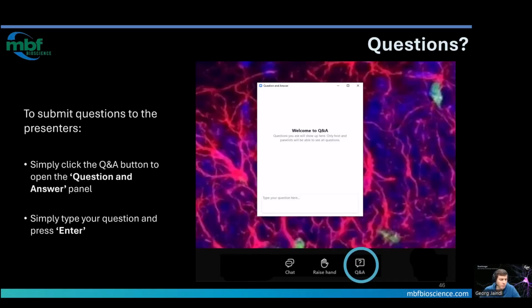There's a question, can two different masks or ROIs in a single field of view be illuminated with two different laser powers? And the answer is yes. For each ROI that you specify, by default, it uses the global laser power, but you have a way to specify and override the laser power for each ROI individually. And also you can specify multiple masks for power boxing if needed.